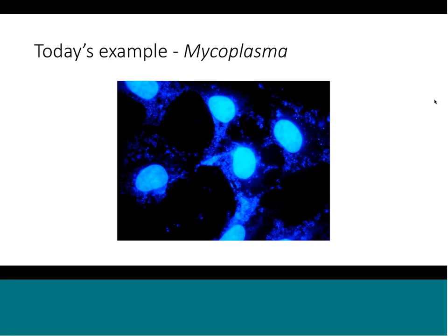They also have small genomes, and the tree should build pretty quickly. I say that, but one of the things in PATRIC is it's all based on a queue. So these trees can build very rapidly, but you may be waiting for a long time in the queue to build your tree.